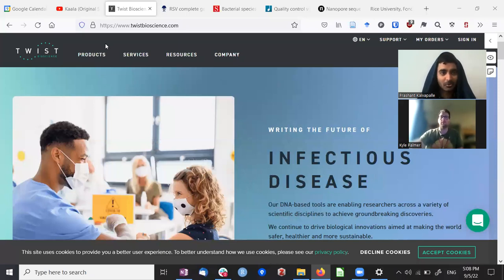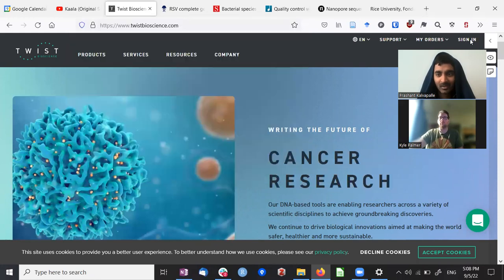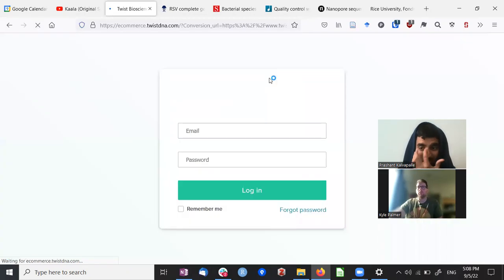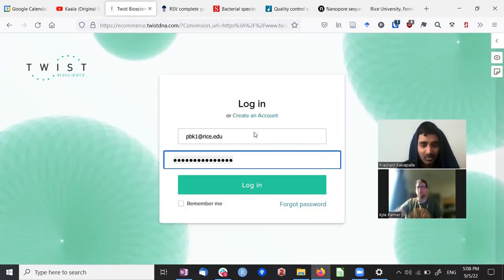Okay, so you go to twistbioscience.com and you can make an account. I think you need to give the lab, maybe your RICE email might be better.